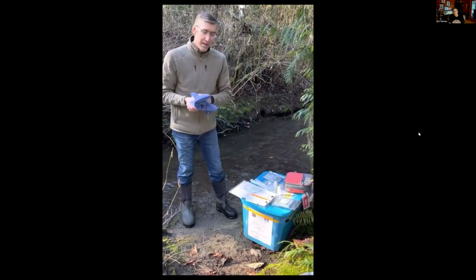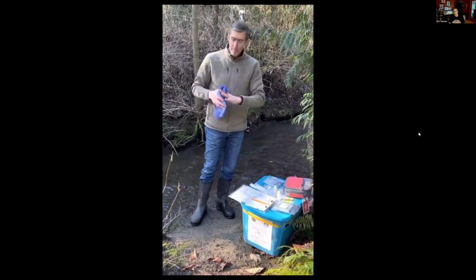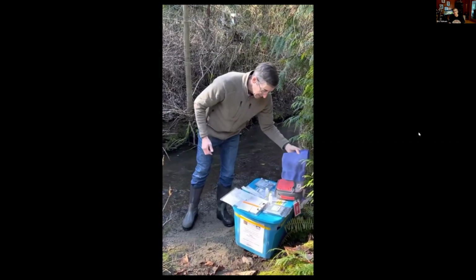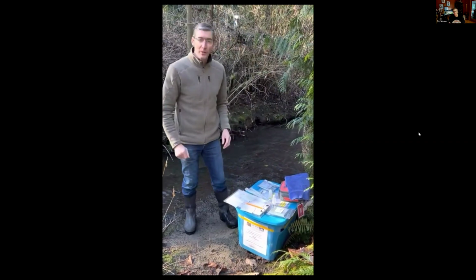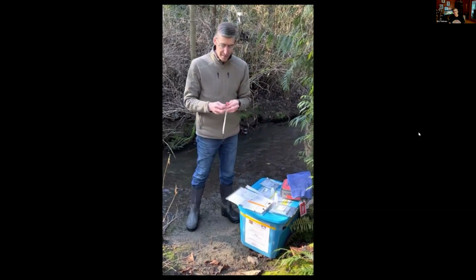So I mentioned clean, dry hands. So I'm going to dry off my hands so I'm not getting any additional bacteria or contaminants on the card. I could use hand sanitizer if I wanted to be absolutely careful. And now I'm going to get my 1 milliliter pipette out.